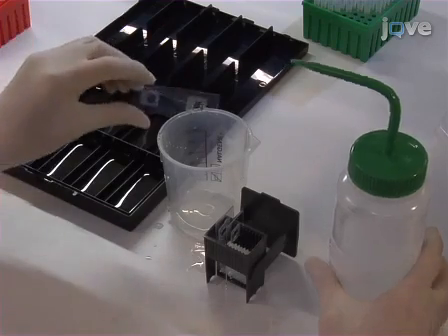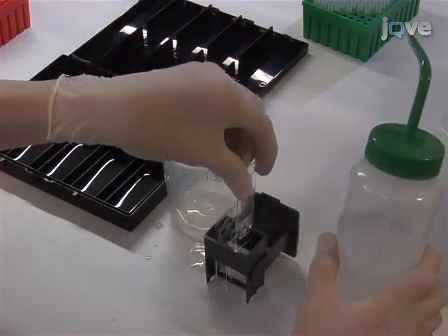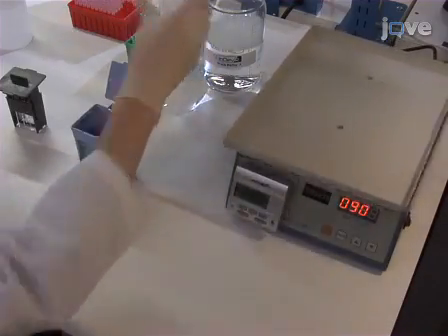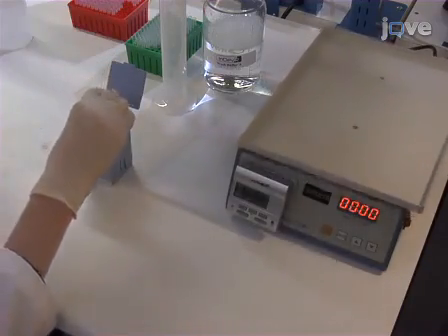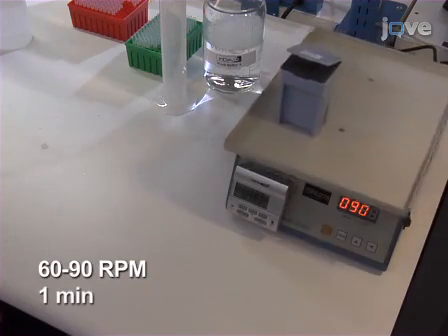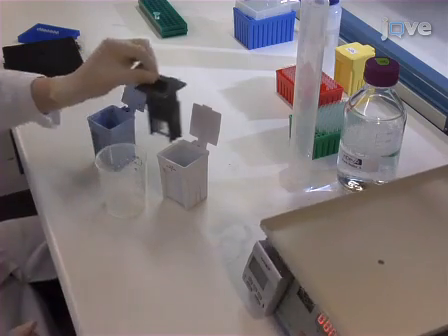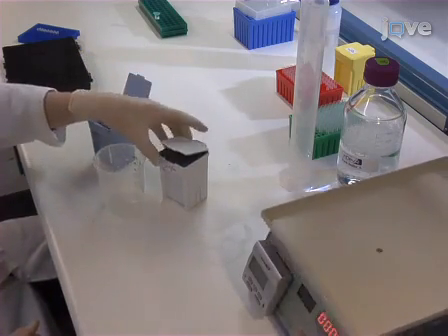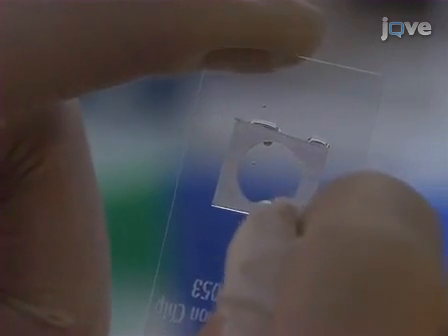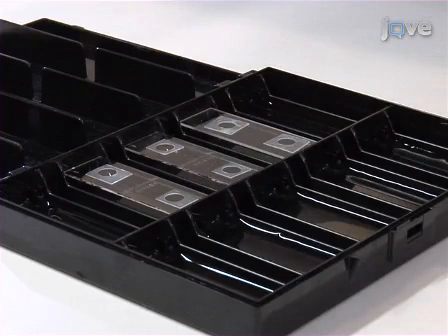After hybridization, remove the slides from the humidity chamber and briefly rinse each slide with 2 milliliters of wash buffer D. Place the slides into a slide rack. Add 110 milliliters of wash buffers A and B to separate containers. Using an orbital shaker, wash the slide rack in buffer A at 60–90 rpm for 1 minute, then briefly rinse with wash buffer D. Transfer the slide rack to wash buffer B and wash for 5 minutes. After washing, gently dry the arrays and place dried slides in the humidity chamber in preparation for Amplifox colorimetric detection steps.